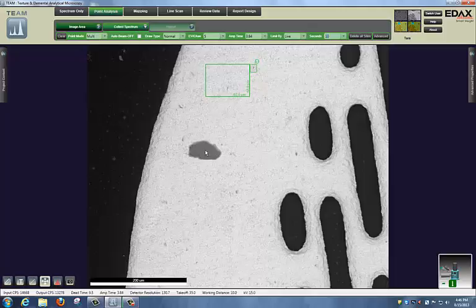We could also left click one time for a spot, and you could collect from various areas. If you decide that you don't want an area, you just hover over it again until it turns red, and then you left mouse click again.